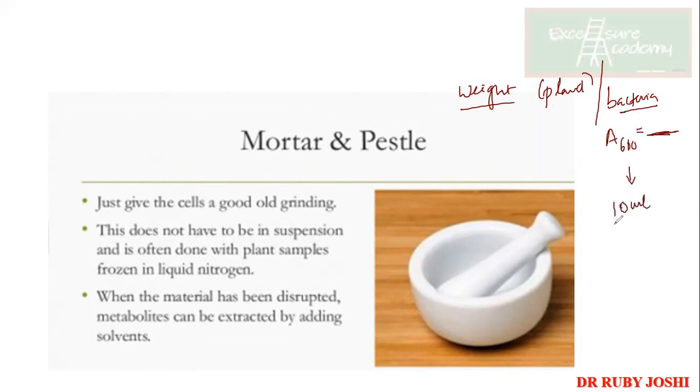Okay, I take 10 ml of bacterial suspension at an absorbance at 600 of 0.8, saying that these cells are in the logarithmic or exponential phase, the active phase of the bacteria. I took a total of 10 ml and centrifuged it, and whatever I get I put into liquid nitrogen, and then put it into a mortar and pestle and ground it. Now what I get is the required proteins and DNA. Depending on the requirement, I add the buffer and go for the further steps.